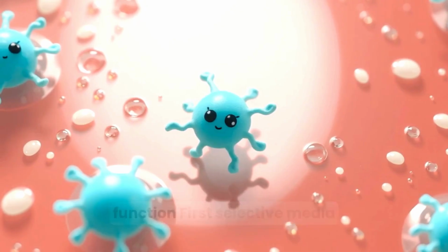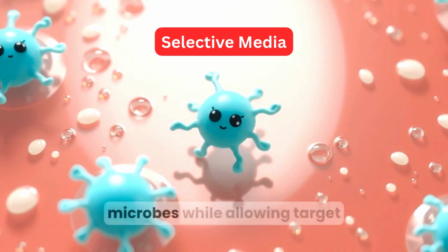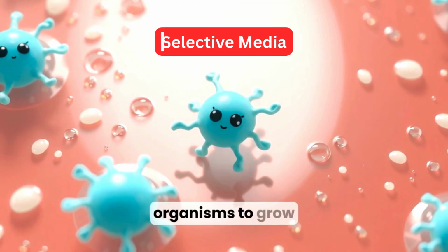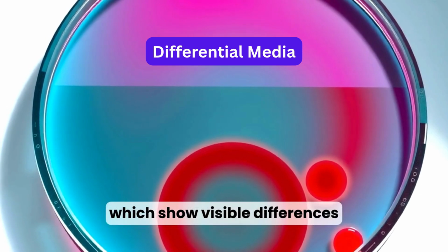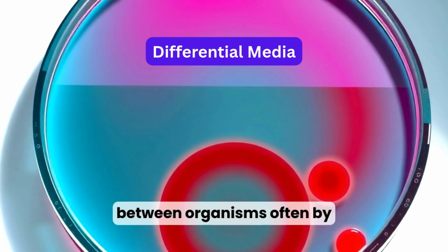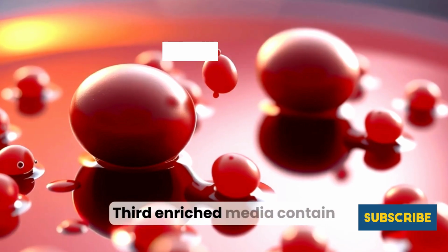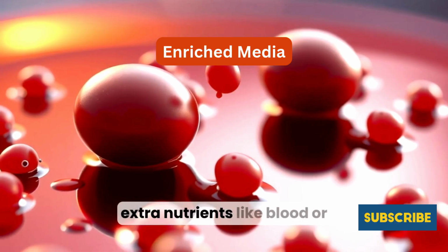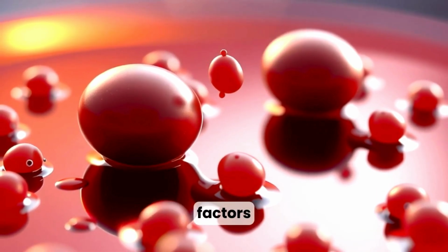Media are classified by function. First, selective media, which suppress unwanted microbes while allowing target organisms to grow. Second, differential media, which show visible differences between organisms, often by color changes or hemolysis patterns. Third, enriched media contain extra nutrients like blood or serum to grow fastidious bacteria that need special factors.